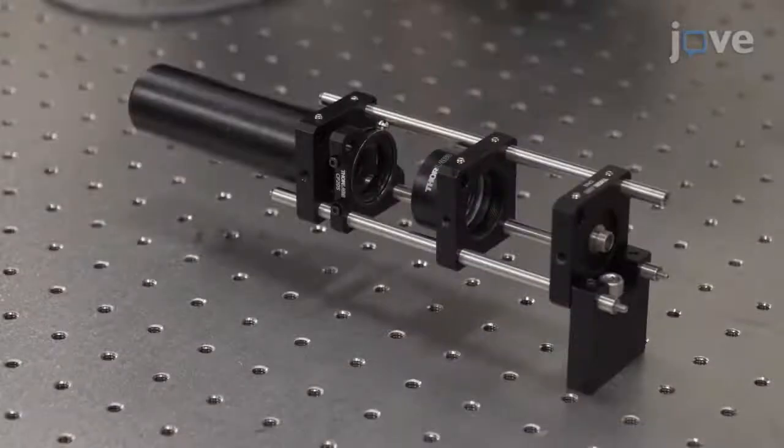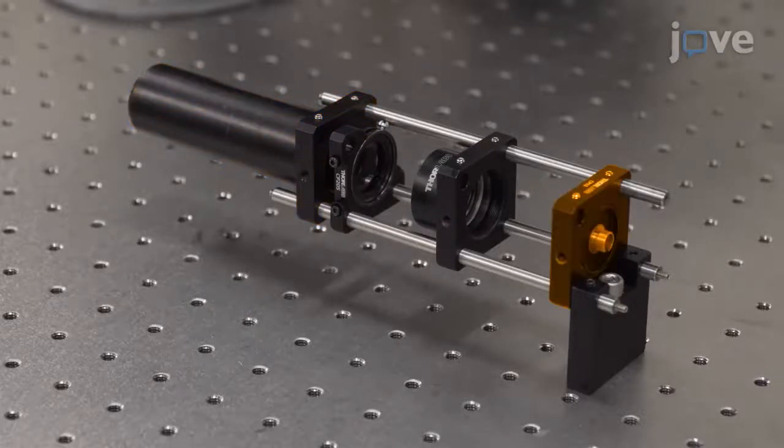This has a temporary coherent light source connected to a single-mode fiber, a fiber adapter, achromatic lens, and iris.